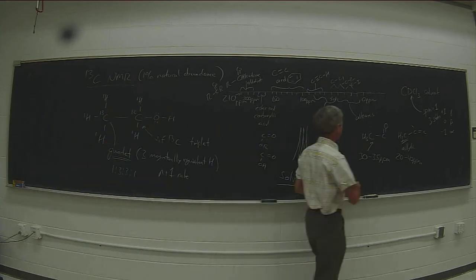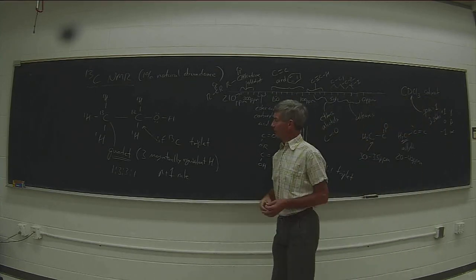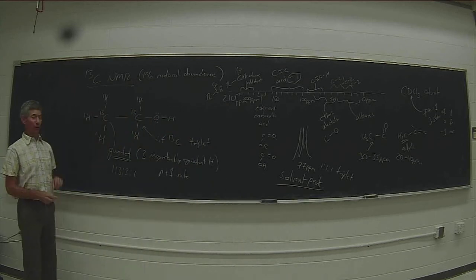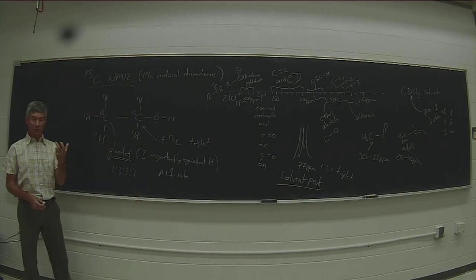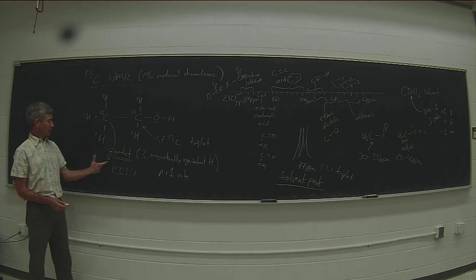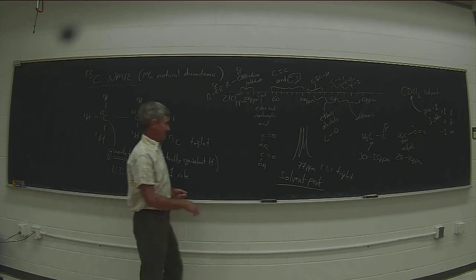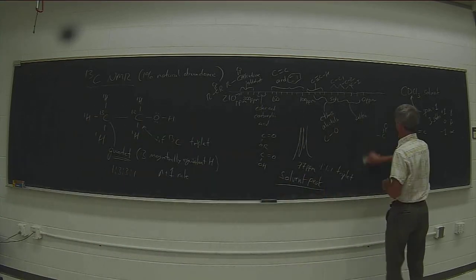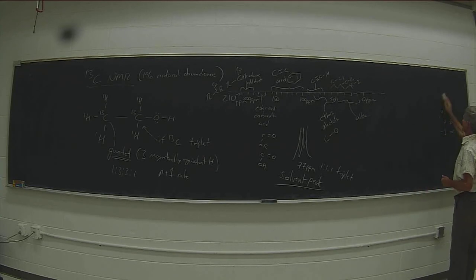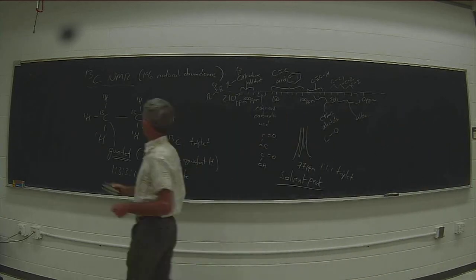So one complicating factor of carbon NMR is caused by the low natural abundance. And what that means is if we allow the hydrogens to split the carbon so that we don't even see a single peak, we see a 1-to-3, 3-to-1 quartet, we'll actually have a very poor signal-to-noise ratio. And that would require even more scans. Sometimes for a very dilute sample, especially if it's a high molecular weight compound, it's actually necessary to run these spectra overnight in order to get enough resolution.